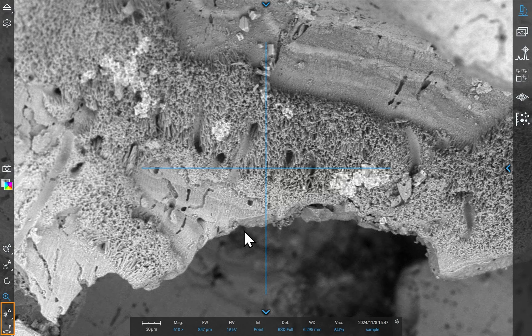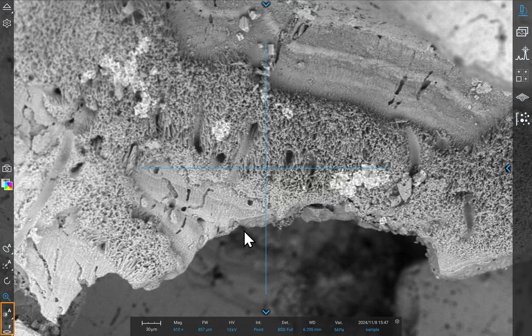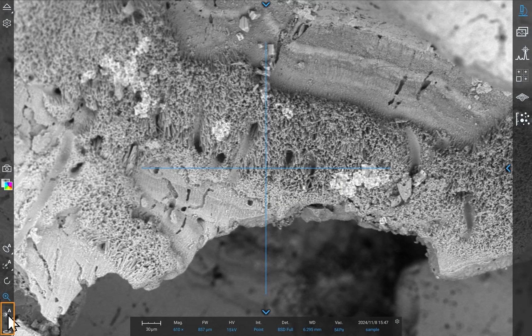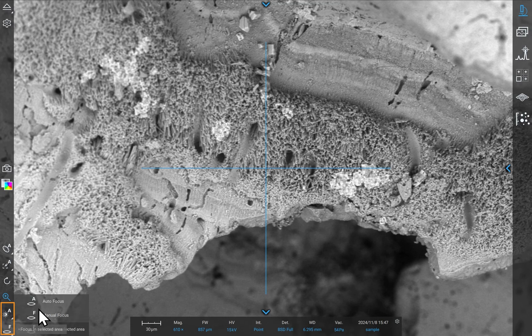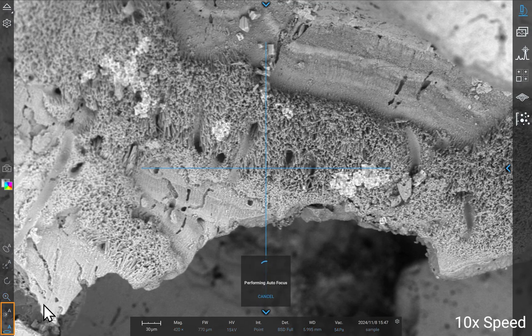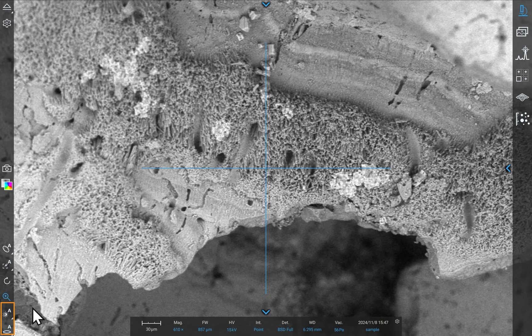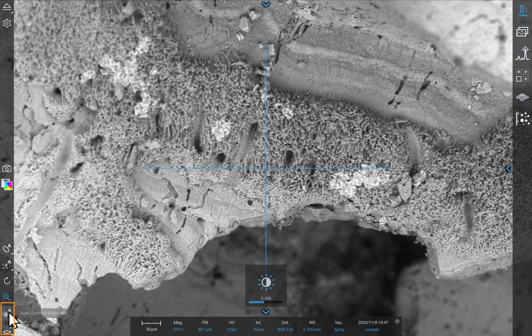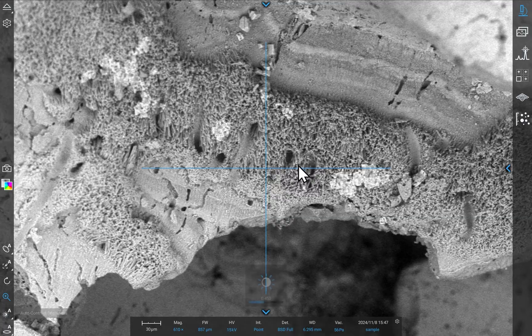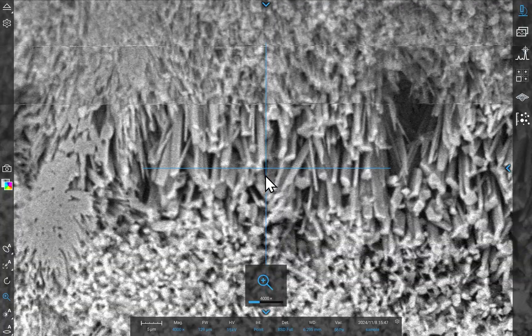Now that you have your area of interest centered, click on Autofocus and Autocontrast Brightness on the left toolbar to improve the image. Use the mouse wheel to zoom in and out.